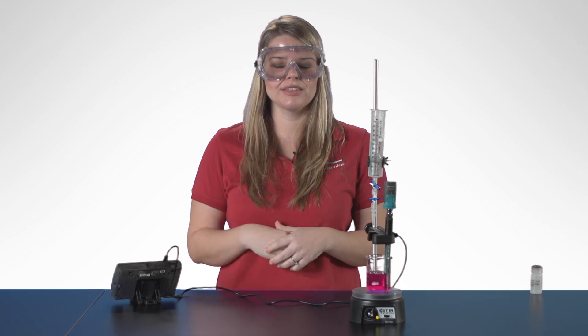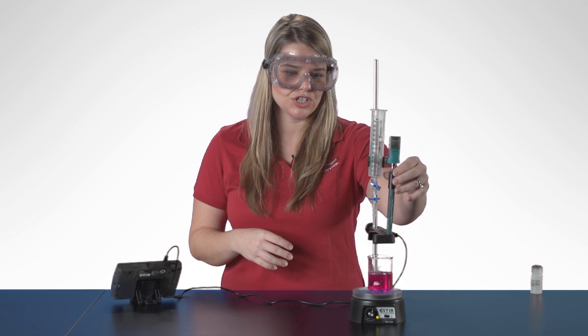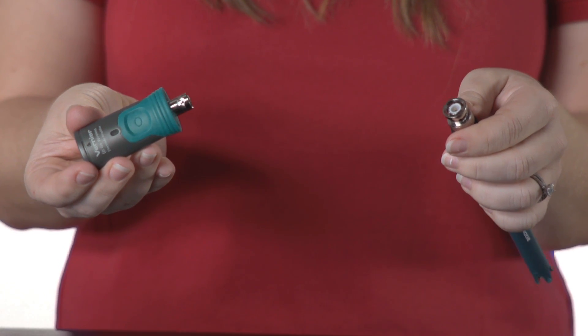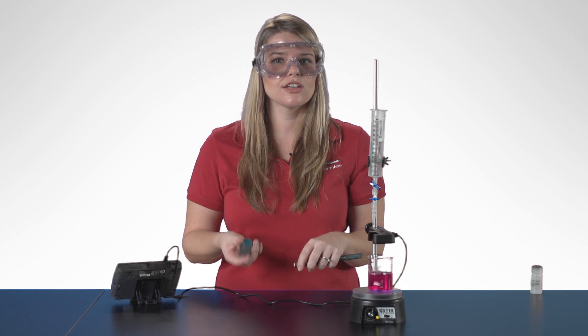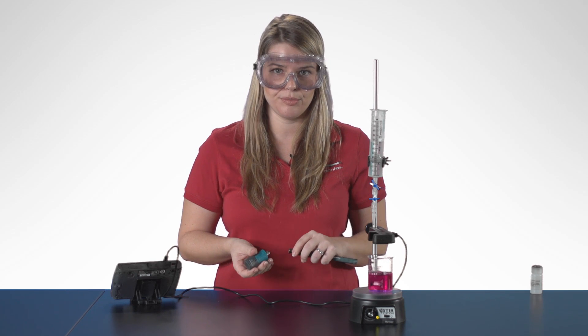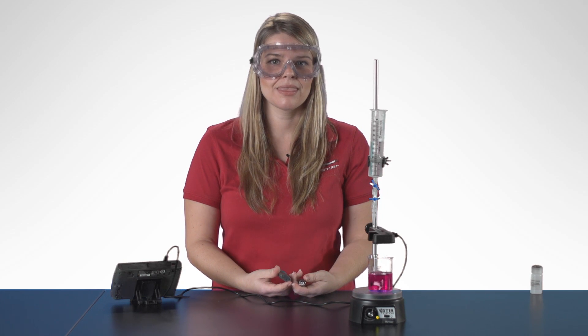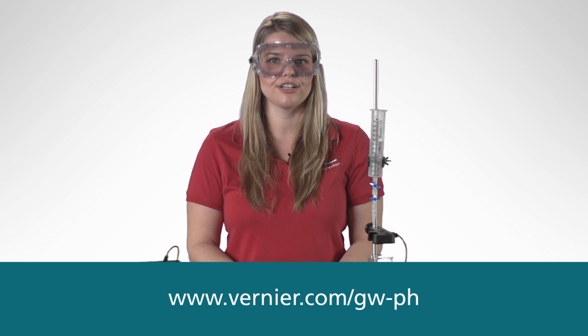I can also repeat this process for the second derivative. The Go Wireless PH is connected via a BNC connection, so you can connect any other BNC electrode to the Go Wireless electrode amplifier — such as our Oxidation Reduction Potential electrode, our Flat PH electrode, or third-party electrodes. It's also compatible with iPads via Bluetooth Smart. If you have any additional questions about the Go Wireless PH electrode or any other chemistry questions, feel free to go to Vernier.com or email chemistry@Vernier.com.